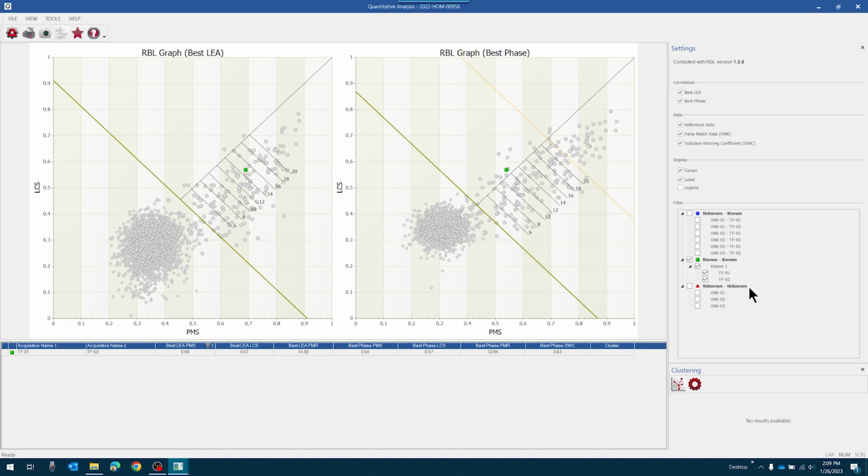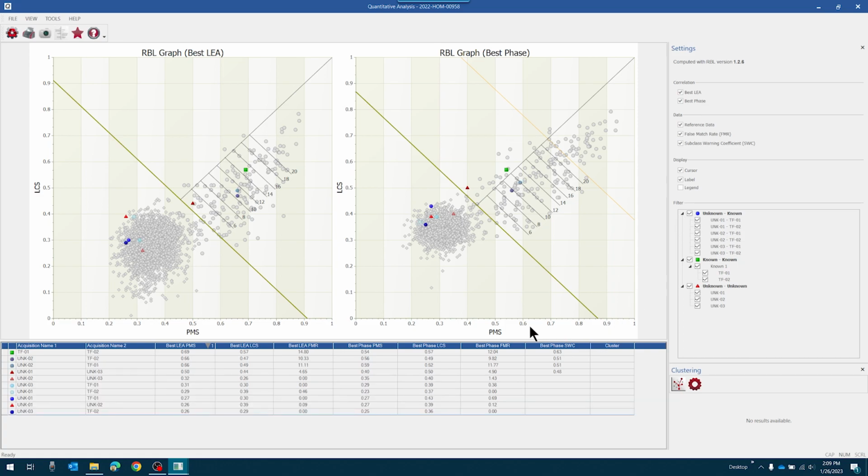And let's pause there for this episode, because actually let me turn these both back on here. We'll get the full list, and then we'll end this episode here, because the next thing I want to talk about is the clustering, and that's going to take an episode on its own.